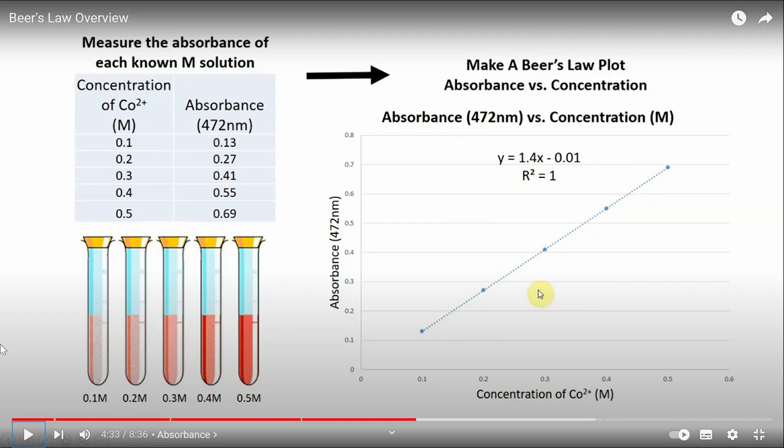Yes? In the spectrophotometer, they put it in and it actually comes out. You guys are going to go home tonight and do a little experiment on the computer where you actually practice doing it. Yeah, it comes out from the instrument. It actually gives you a little display and you just read the display.